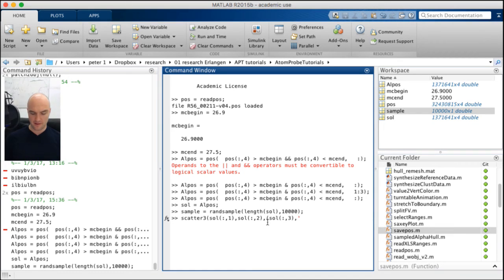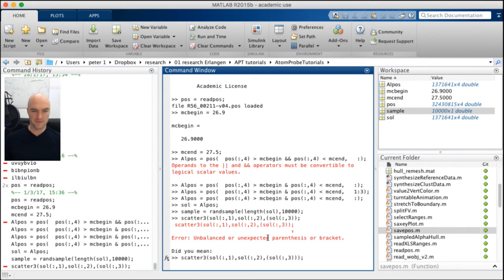Also, what I'm going to type in is point, otherwise it's going to appear as circles. Now I'll leave it out, and we'll just take the simplest version of the command, and then later I'll show you how to use some extra things to make it up. Did I forget about something? I did. What did I forget? Oh, I opened a bracket here. God knows why. Anyway.